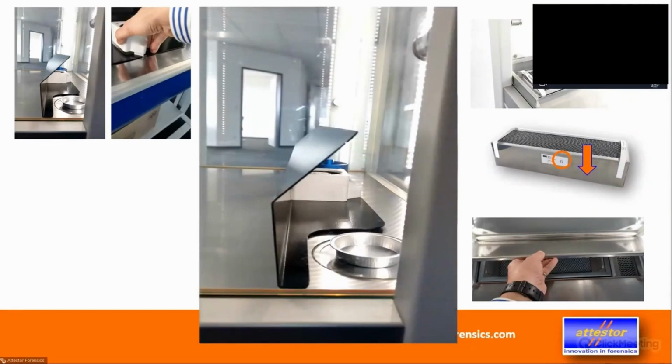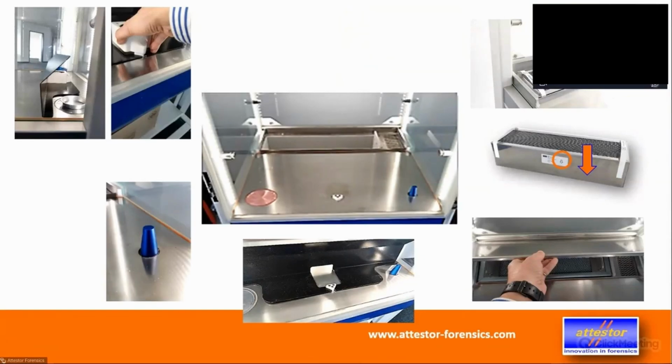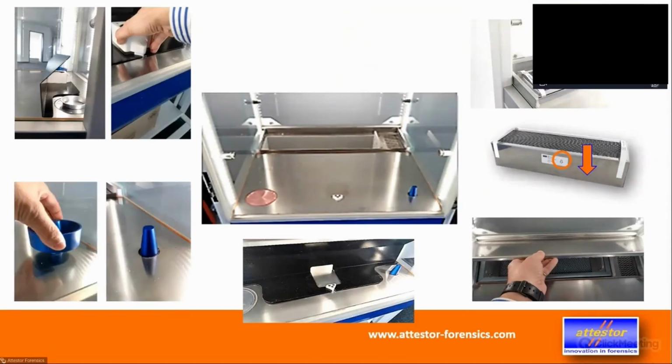And how does it work? The fan pulls air from behind and then blows it upwards. Because you might have evidence straight above your fan, we don't want all the humidity or all the glue going directly onto that system. We have this air guiding baffle in there, which creates the airstream to climb up the front screen and then create a roll inside the chamber. That is the pin I was speaking about, and this is the water tank you put on top of that.